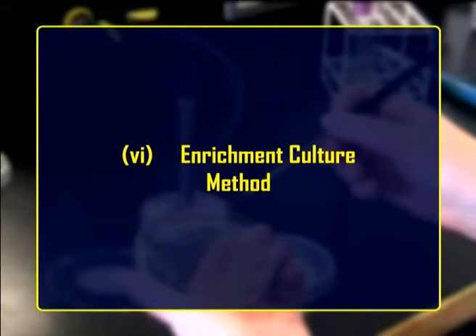Finally, the enrichment culture method. Generally, it's used to isolate those microorganisms which are present in relatively small numbers or that have slow growth rates compared to the other species present in the mixed culture.